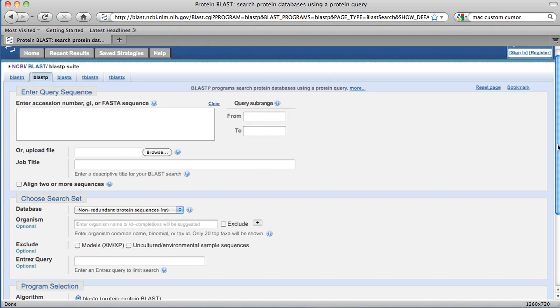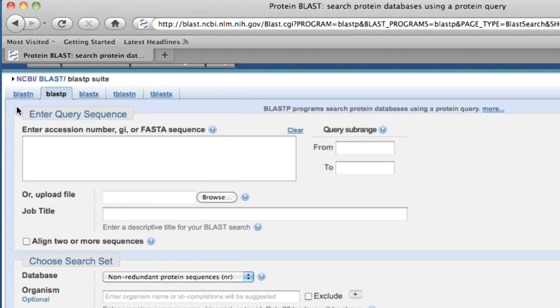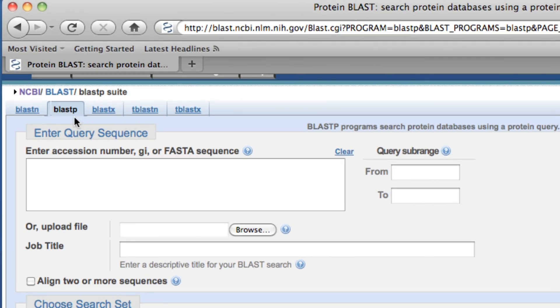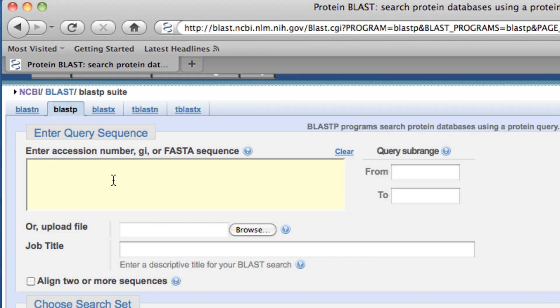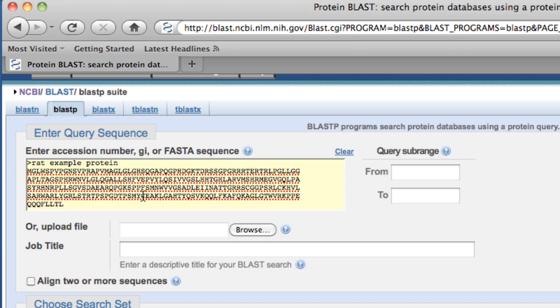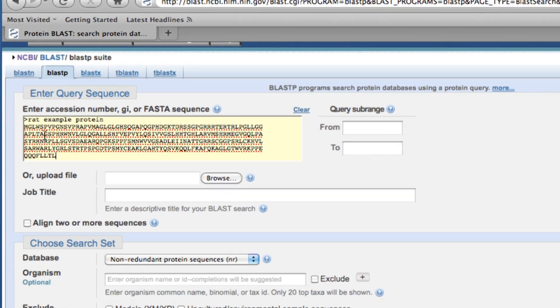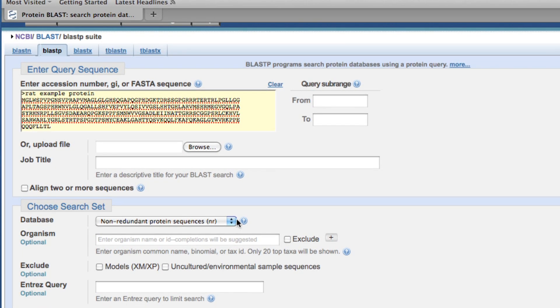Now here is the BLAST input page, and I can switch BLAST programs using these tabs at the top menu. "Enter query sequence" is where you're going to want to take your starting sequence, which is our rat sequence. So I'm going to paste that in. The sequence is in, including the title, and that will help identify the protein. And now I'm going to choose my database.